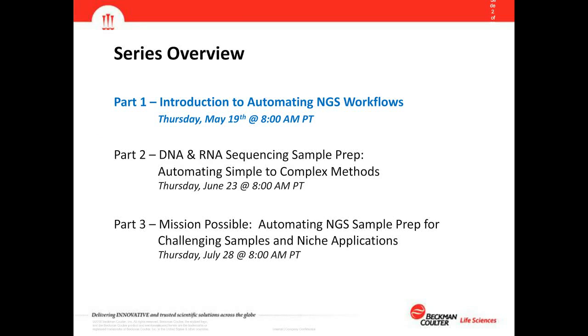As Judy mentioned, this is part one of a three-part webinar series, and so today we'll be talking about introducing customers to automating NGS workflows. We'll continue in June with the second part of DNA and RNA sequencing sample prep, and then go into a little more detail on specific methods ranging from simple to complex.